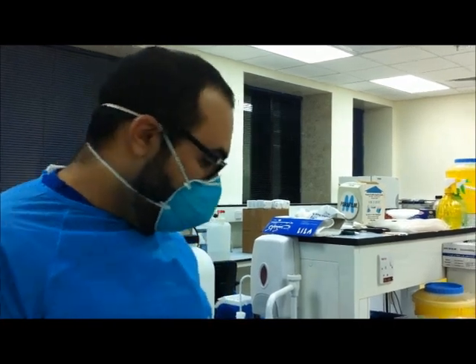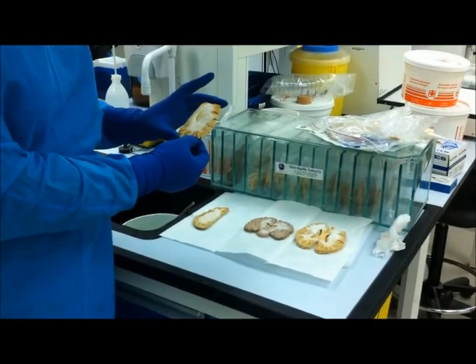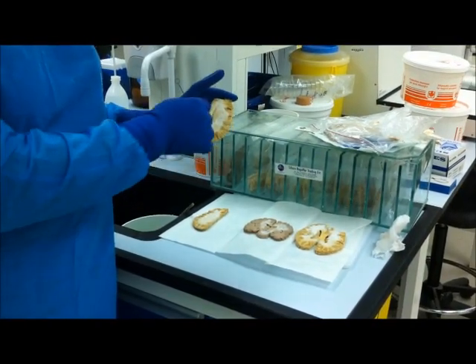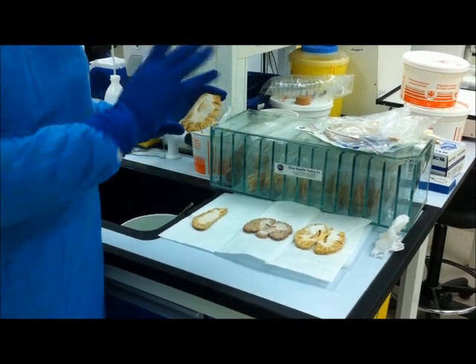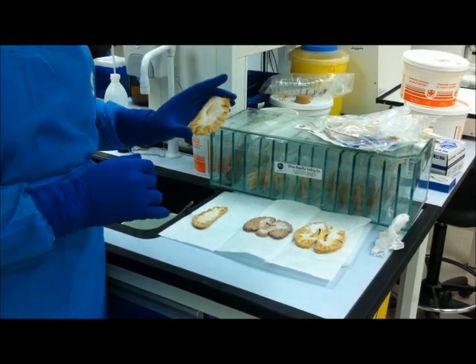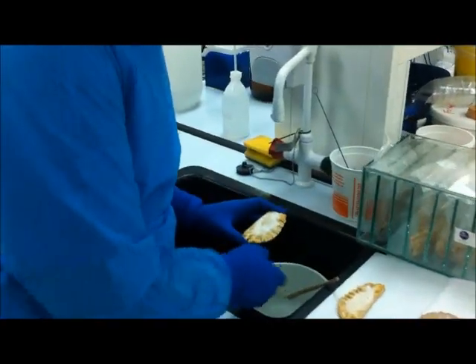Now we start the treatment of crystallization on the brain slices. First of all, I have to warn you: do not attempt to brush, move, or flick off the crystallization on the brain slice, because it will fly everywhere and it might be a danger to inhale.